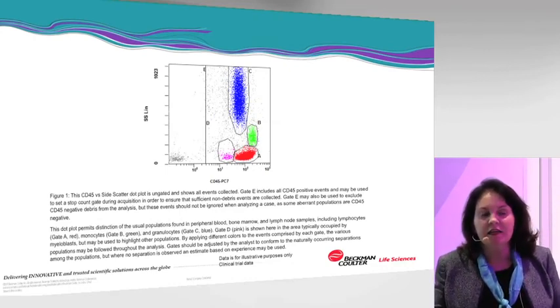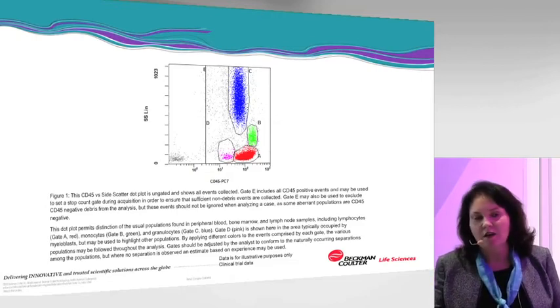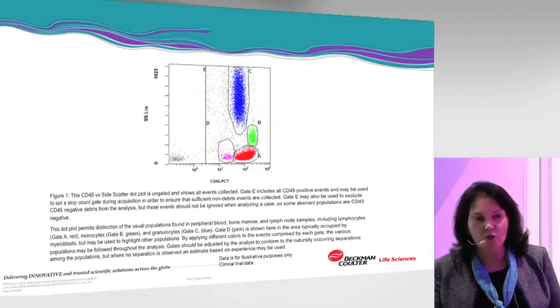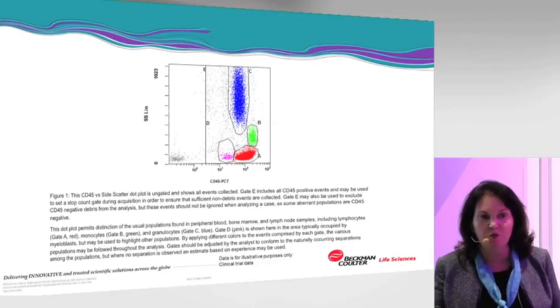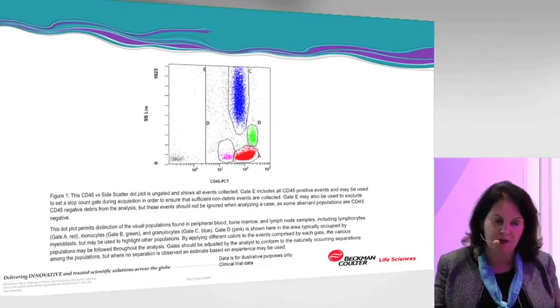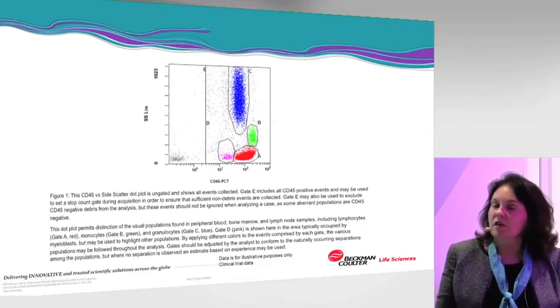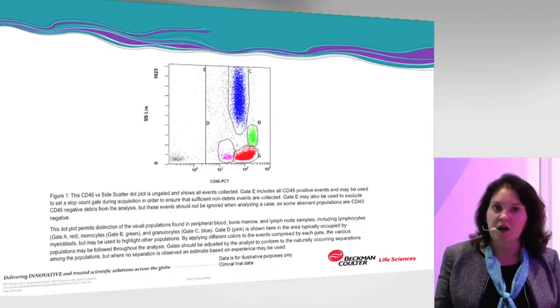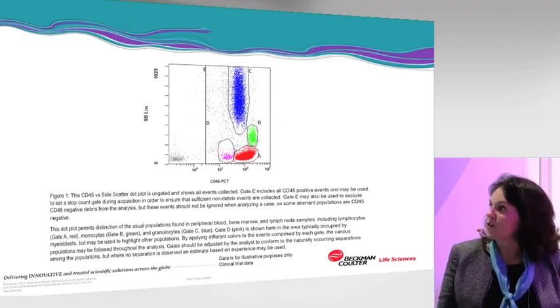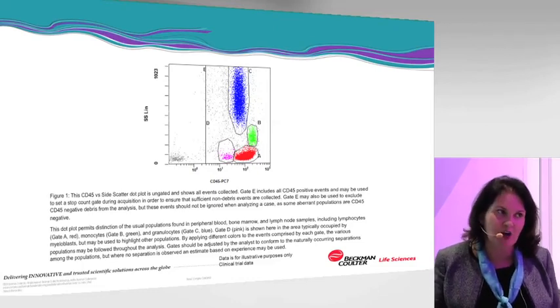And here I'm showing you one of the annotated dot plots. Each of these cases is analyzed using the exact same protocol. It's one that's designed in such a way that you should be able to recognize, with the appropriate training as a hematologist or hematopathologist, the populations of interest. In this particular case, I've described in almost excruciating detail what's happening in each of the dot plots.